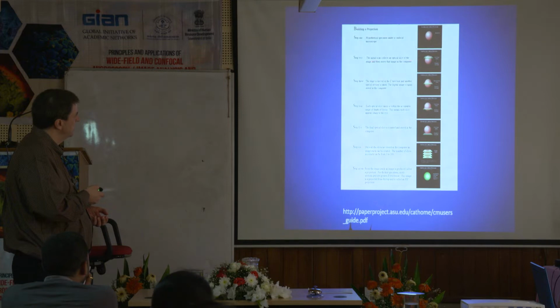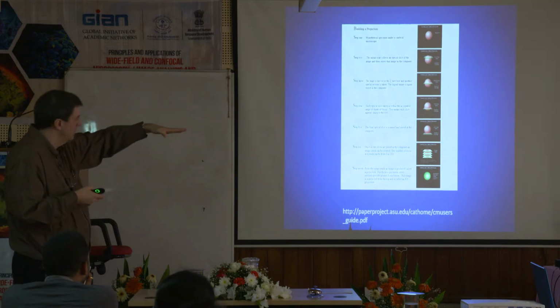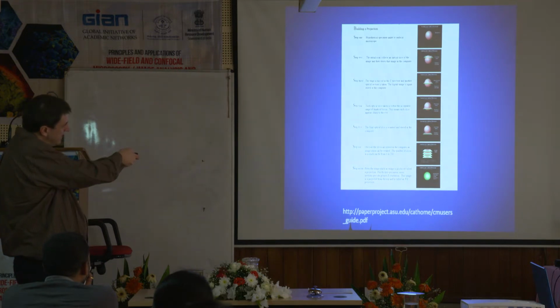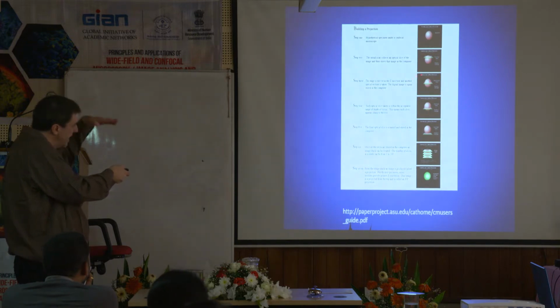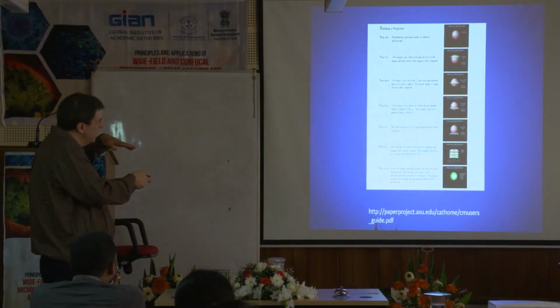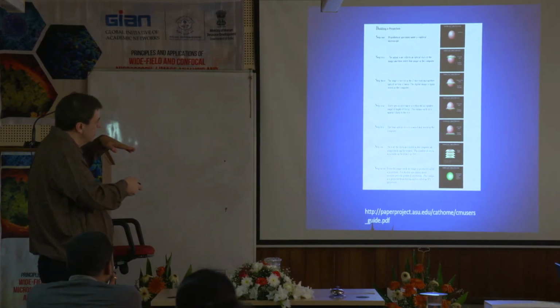The first thing we do is we take an optical slice. And what I mean by an optical slice is we take a plane through there. We take that one optical slice, that image. We focus on that green image right there, that green flat plane. And then we use our microscope, we move down to the next plane down. And we keep this picture. Then we move down. We do another plane. We keep that picture. We go to another plane. We go down. We keep that picture. And then the final optical slice is scanned and stored in the computer.